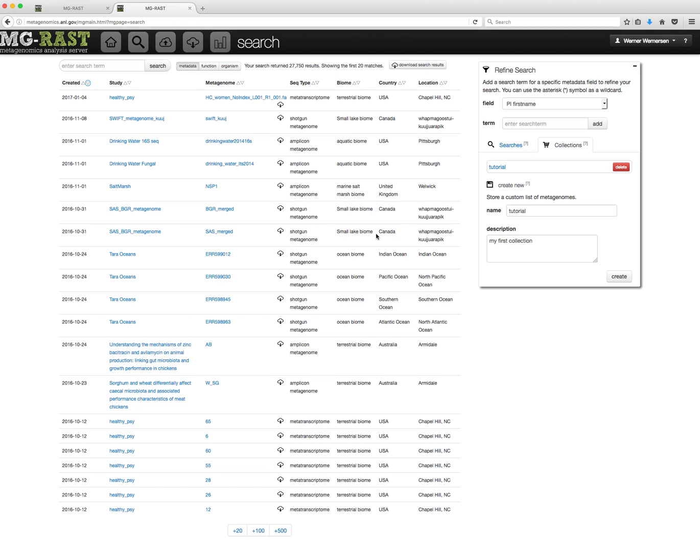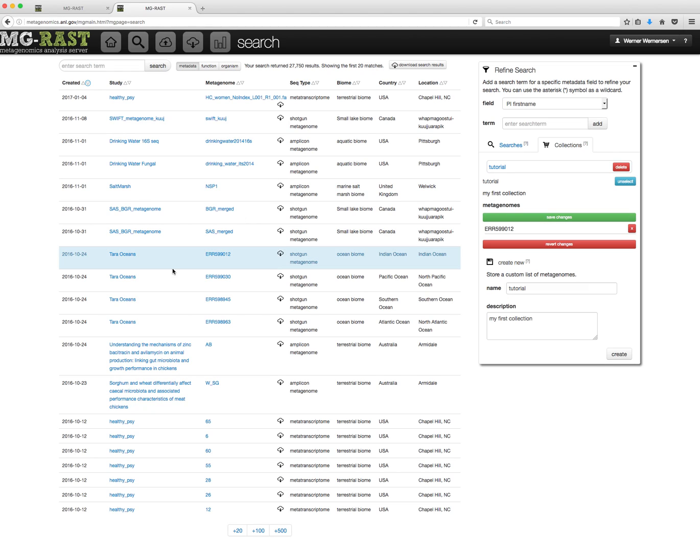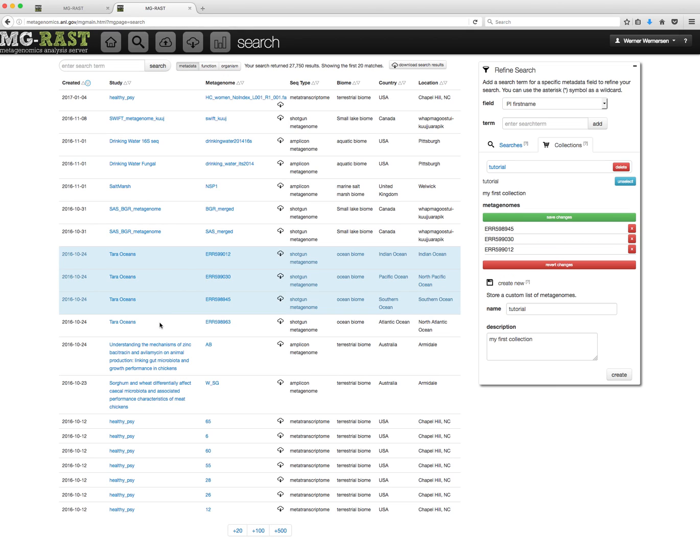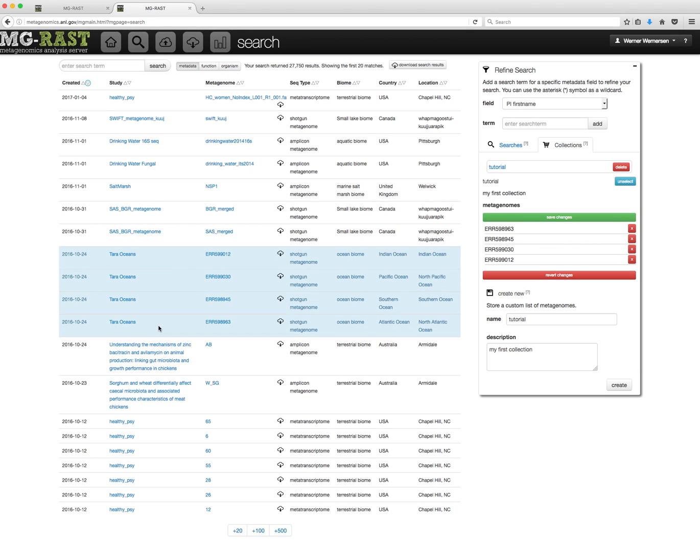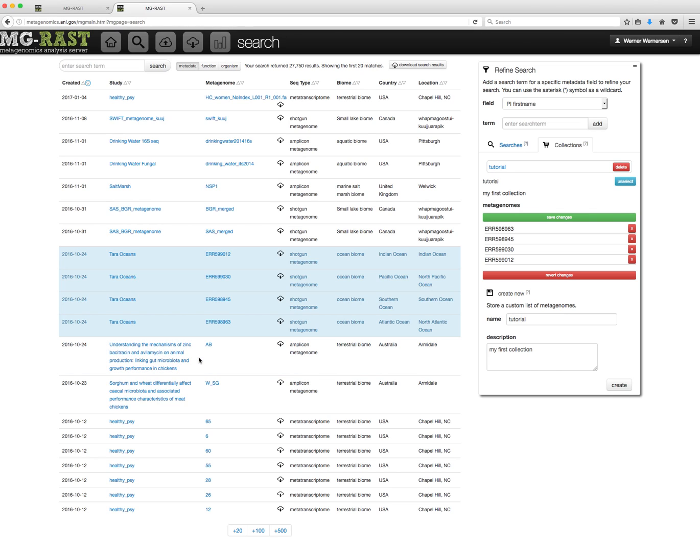Click on the newly created collection to view it. To edit the datasets in the collection, click Edit Metagenomes. Now you can click on a row in the search results to add a dataset to your collection. If you click it again, it will be removed.